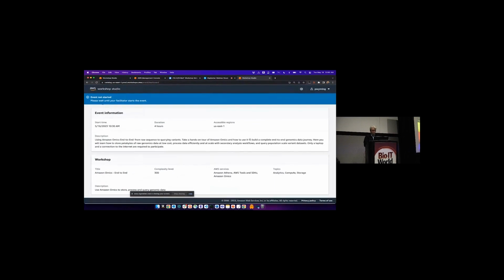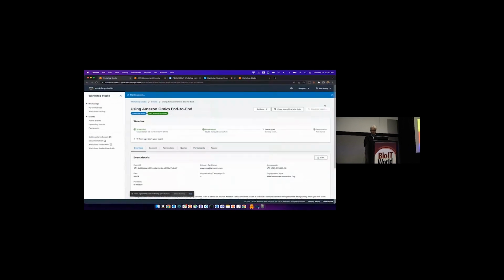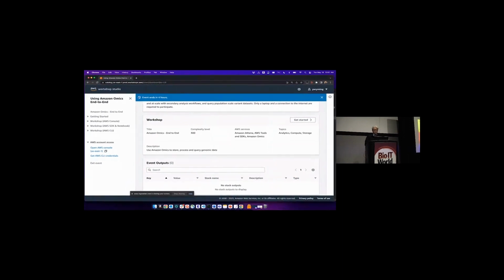And then what it'll do is it'll take you to, I did start the event. There we go. It should take you to here. And this is where you kind of launch off two things. So what I recommend is, I'm actually going to pull this out and drop this under here. So what I recommend is you do two things.